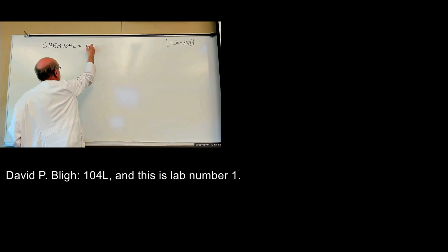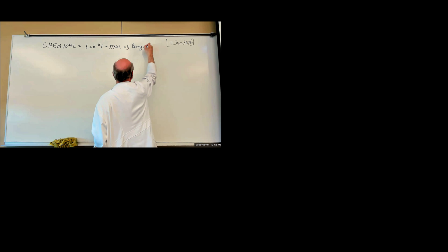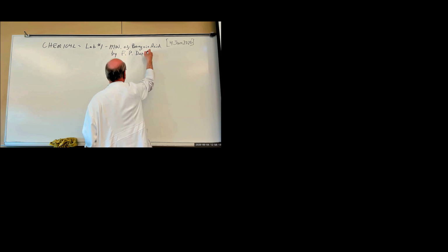104L, and this is lab number 1. I abbreviate molar mass, molecular weight of benzoic acid by freezing point depression.